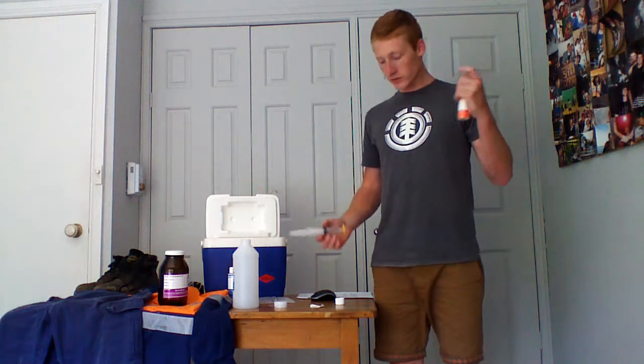Now we've ticked dissolved metals, field filtered, so the laboratory knows that it's already been filtered. From there we pass through the filter, so we're only collecting the dissolved metals. To tick total metals, the filtering wouldn't be required.